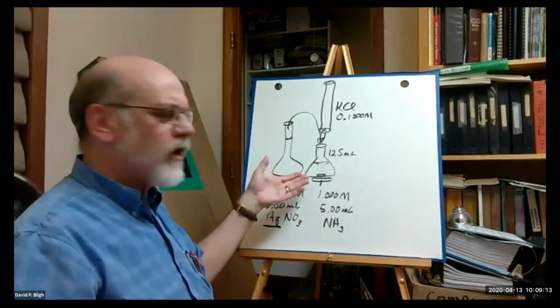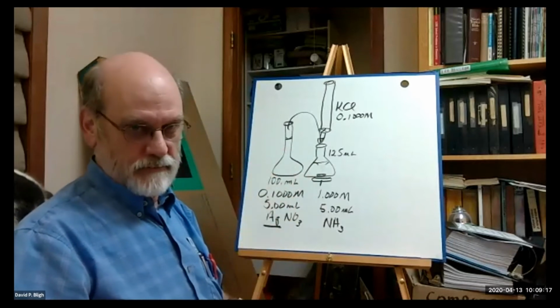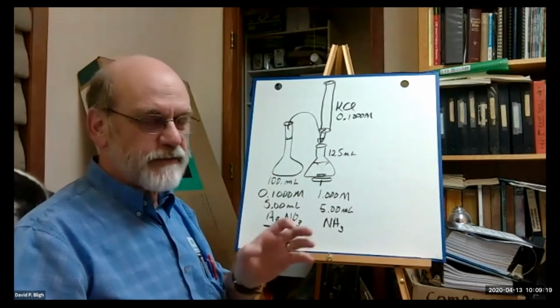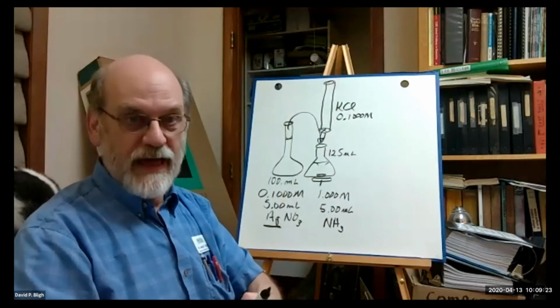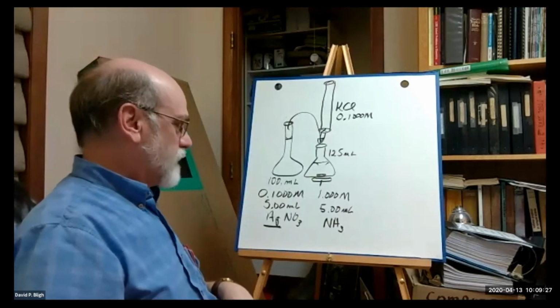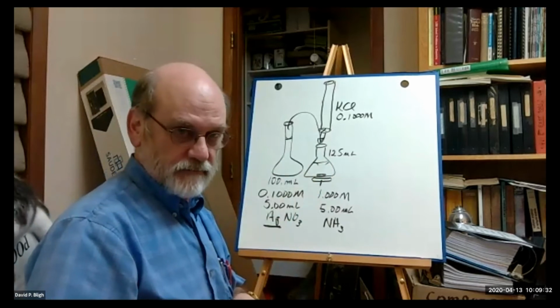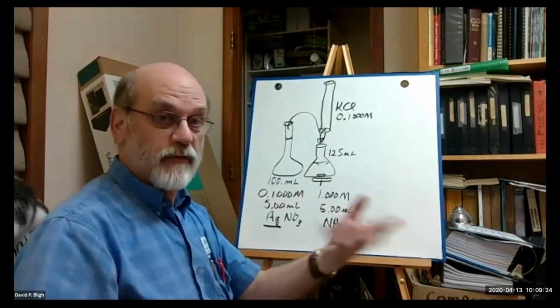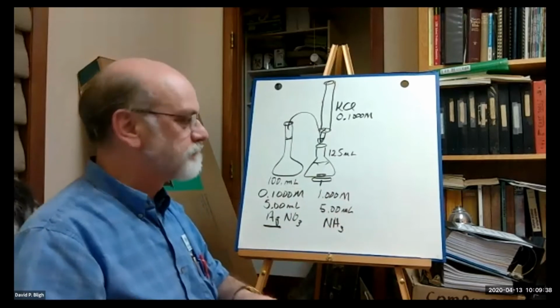So how do you know when that silver chloride appears? Right? It's very difficult to see in the bright lights of most rooms, labs, workspaces. So what we do is dim the lights and just let the ambient light come in from outside, just so we can see what we're doing and be relatively safe.